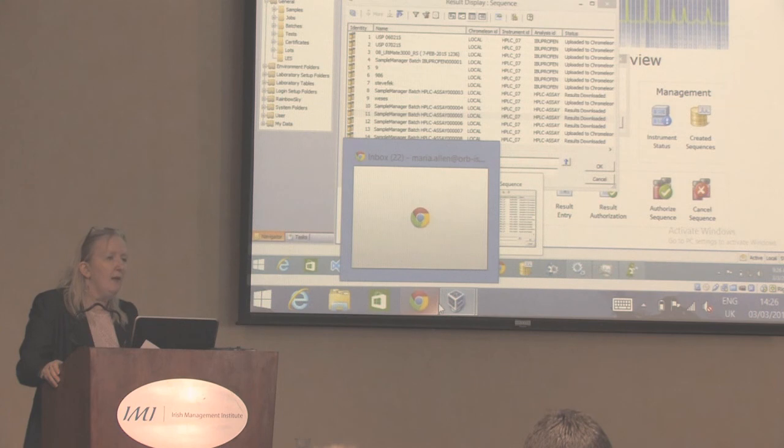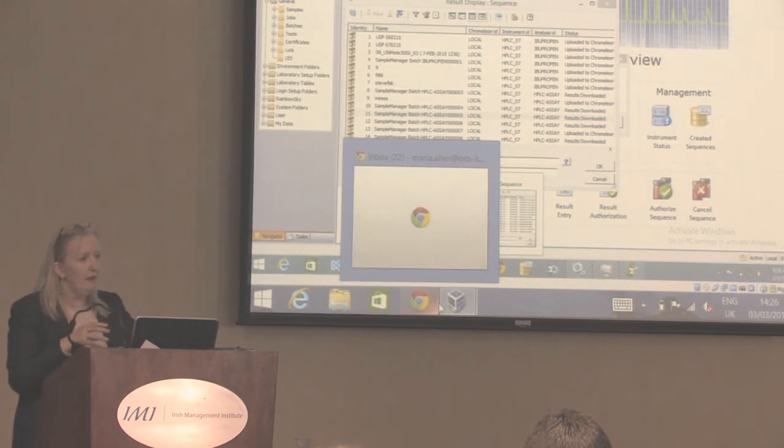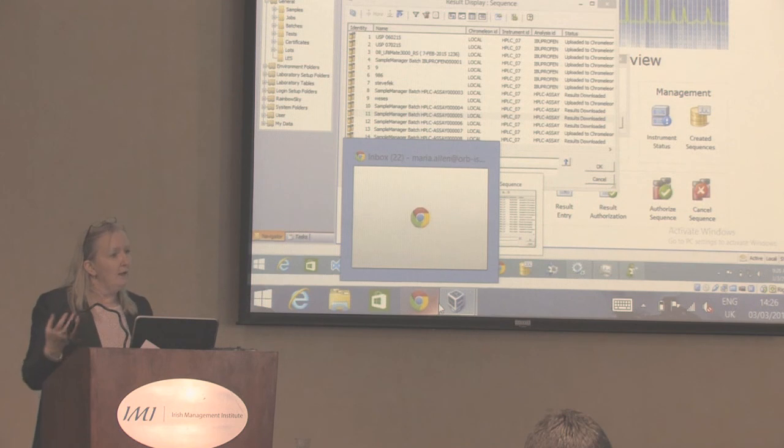I think it's like anything else. Once you have one method built and you know how to build that method, then if you have similar methods, you can copy them and edit them, or use that as a framework for future methods. But maybe we can look at some of your methods or an example method for you, so that you can see it in the demo LES system.